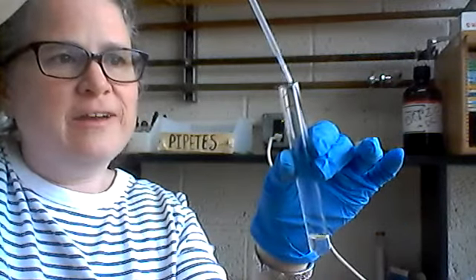We're not going to see any changes here because this is water. But this is what I'm going to do for each of them. So you kind of add a couple drops, shake as you go along. And then it'll sit for 5 minutes and we'll get to see the reaction. If there's protein, it'll turn kind of a violet color.